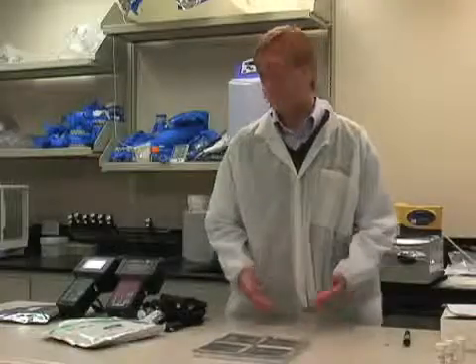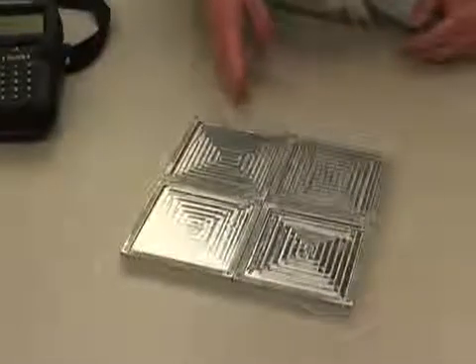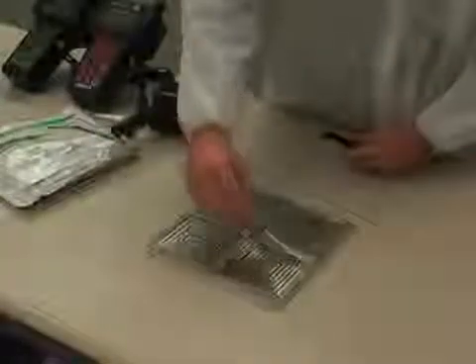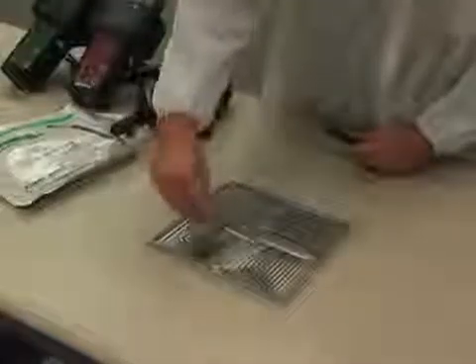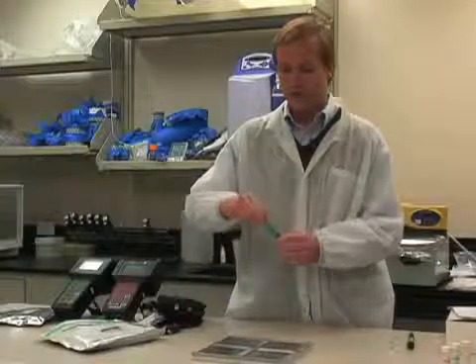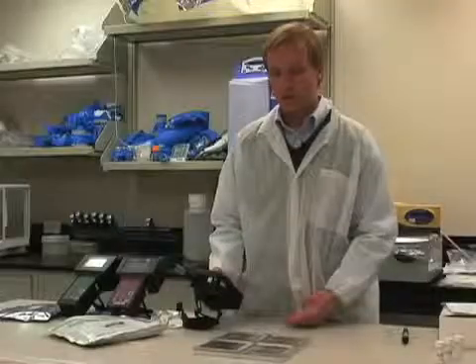In addition to just doing an ATP dilution study, if you want to compare Snapshot to the Pocket Swab Plus in your actual environment, I'm going to show you how to do that as well. So here we have a contaminated stainless steel surface on one side and a clean surface on the other side. I'm going to swab an area with the Pocket Swab Plus, just as you normally do. Activate the device as you normally do. Then I'm going to place it in the Charm machine, press OK, and get your reading.